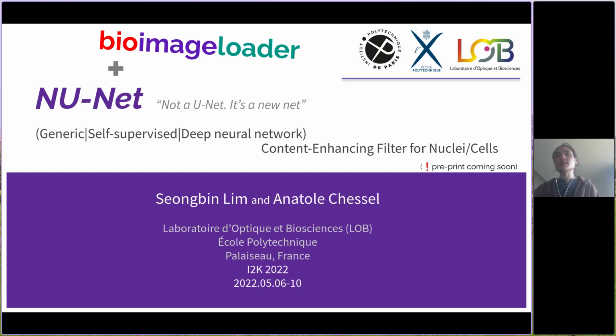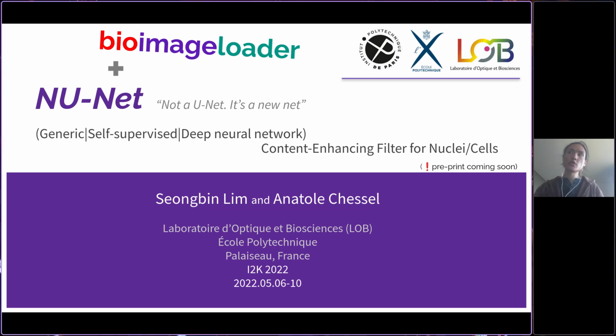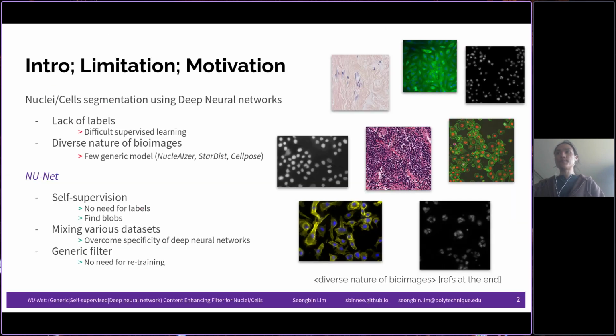And NewNet is not another variant of UNet that we know. It's a totally different type of deep neural network. Essentially, it is a content enhancing filter, which is a generic and self-supervised deep neural network. So we are working on a preprint, so please tune in.